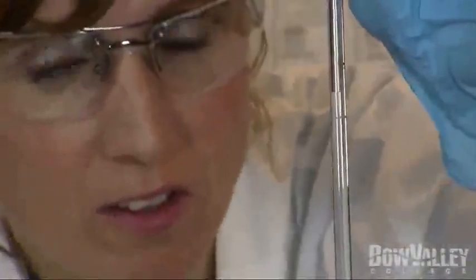Slowly lift your finger and allow the liquid to exit until the bottom of the meniscus is sitting on top of the line marked on the pipette. If you allow too much to exit, simply use the pipette bulb to draw more liquid in and try again. This takes some practice, so be patient with yourself.